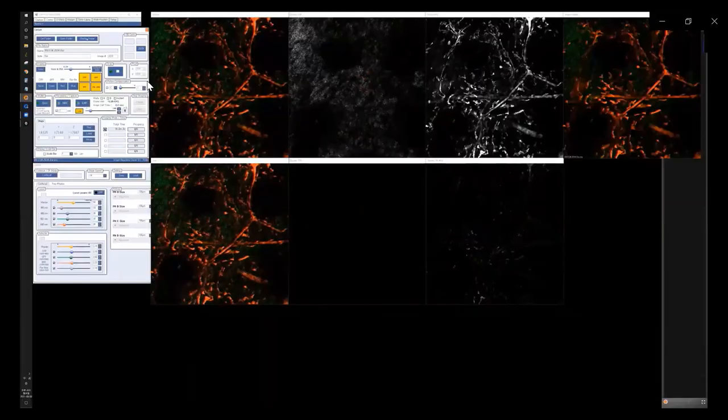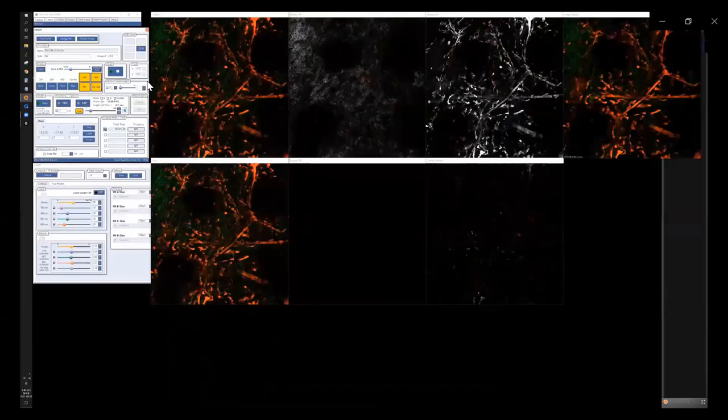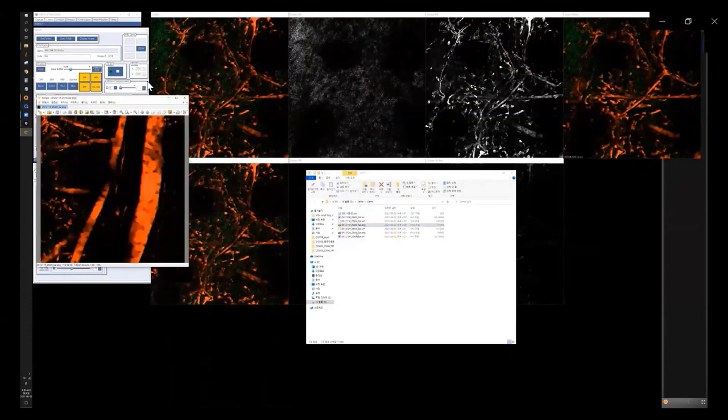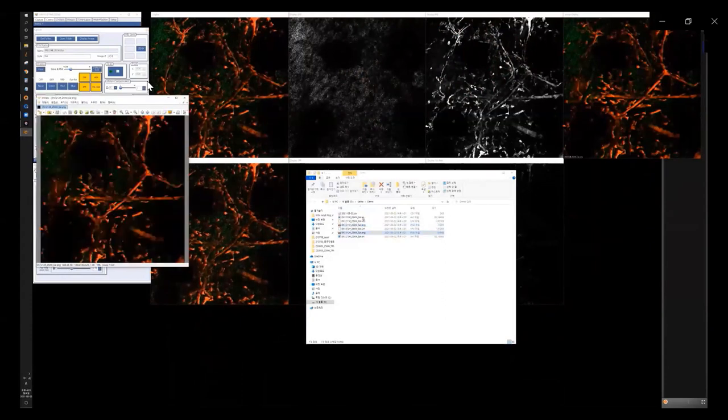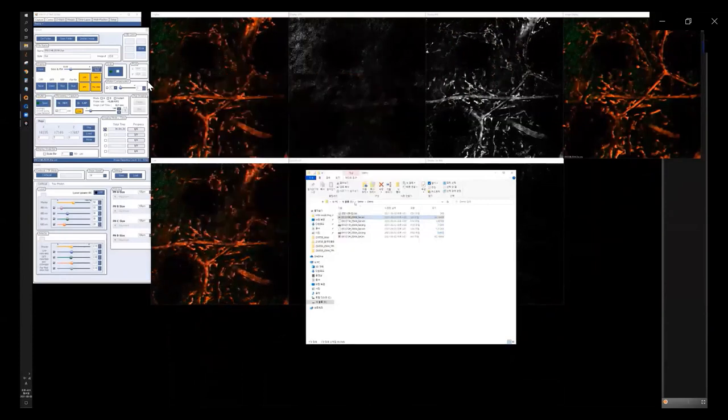When we capture a frame, we get the reserved image on the image display window on the right. After finding another area of interest, we capture the image and here comes the reserved raw image file. When we record the real-time video, this is the real-time movie of blood flow in the blood vessels of ear skin. If we click 'Open Folder', we can find every raw data file acquired in the directory. Image data captured is created as a PNG file, and in the case of recorded movie data, it comes up as an AVI file.